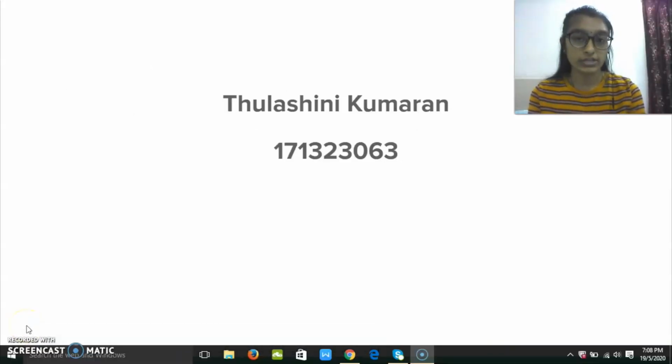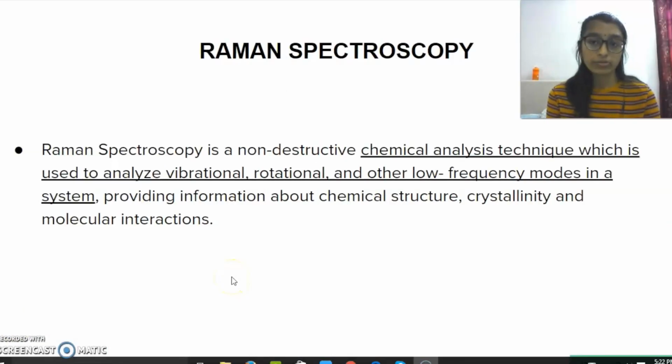My name is Tulashini. Raman spectroscopy is a non-destructive chemical analysis technique which is used to analyze vibrational, rotational, and other low-frequency modes in a system, providing information about chemical structure, crystallinity, and other molecular interactions.